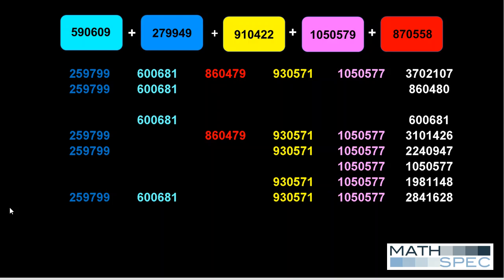For example, the formula CH2O and corresponding mass 259799 are needed in partition 0 to achieve elemental balance. CH2O differs from the carbonyl group by the mass of 2 hydrogen atoms. The other two compounds that match partition 0 are exactly the same as far as the assignments. In addition to matching subfragment masses to masses of substructures, the second discriminating factor is the connections based on the fragment assignments.